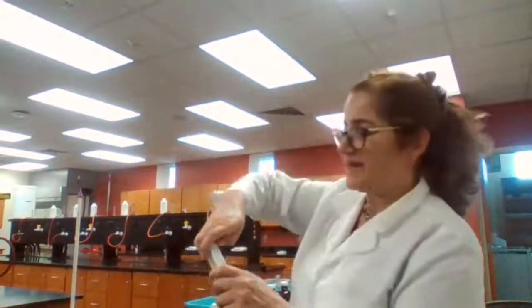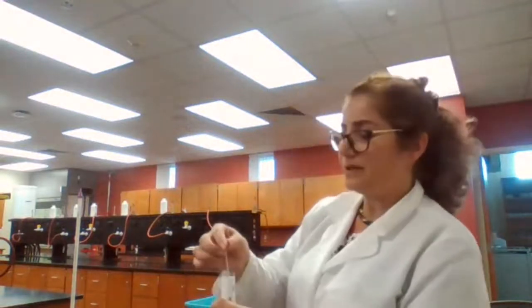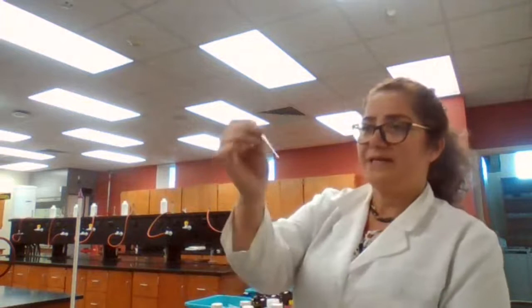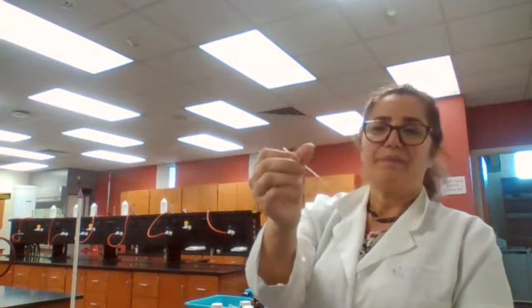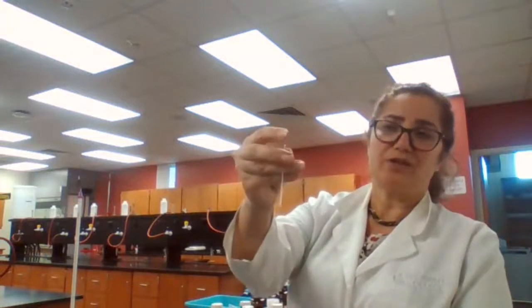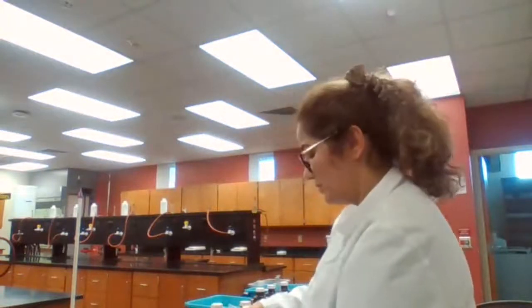In order to place the sample in a Mel-Temp apparatus, we are using a capillary tube. A capillary tube is like a tiny test tube, very small. It has a closed end and an open end. So when I take the capillary tube, I only touch the closed end of the capillary tube because I want to dip the open end into my sample.